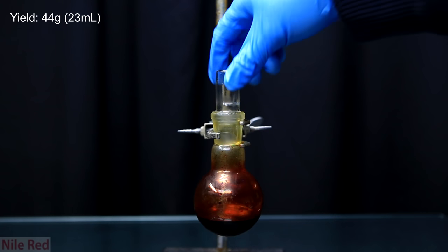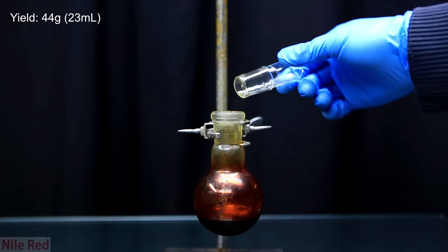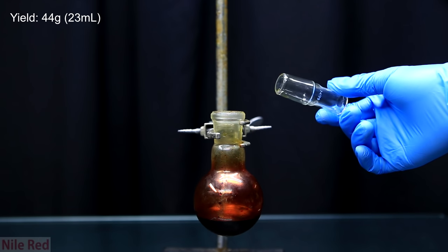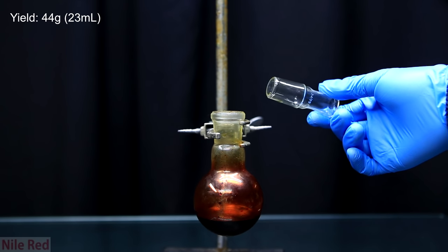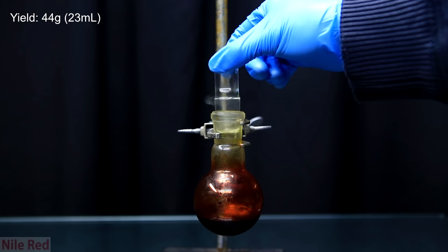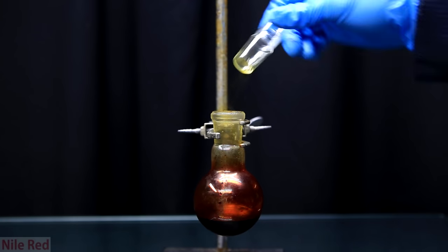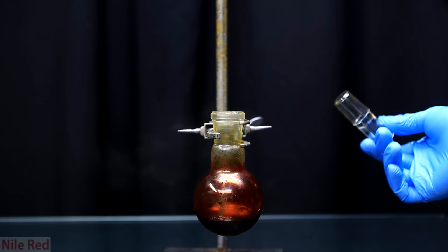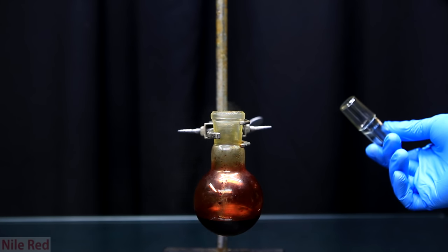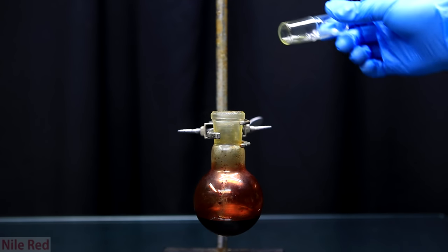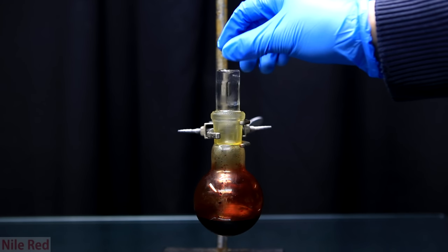So here we have our yield of chromal chloride, which is about 44 grams. It's pretty dense, almost twice as dense as water, so it's only around 23 milliliters. You can see here that when the stopper is removed, it fumes quite a bit. The fuming that you see is when it reacts with moisture in the air to produce hydrochloric acid.